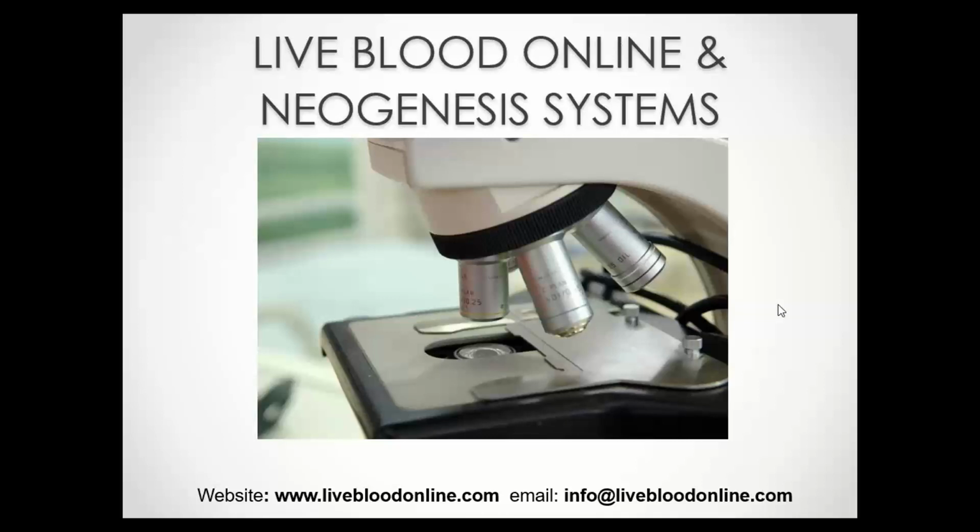Next question is, how much space is needed in a consulting room for the equipment? Well, you'll only need space for the microscope itself, which can usually go on one side of a desk, and then the slides and the cover slips and the other consumables. Most people have a separate monitor also to allow them to show their clients their blood samples on a larger screen, but it isn't essential.